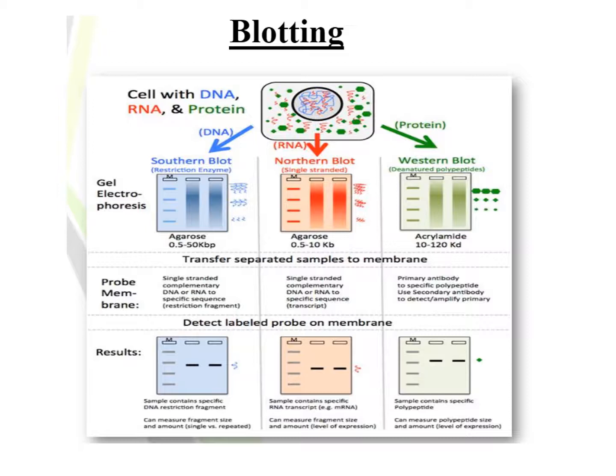So the large mass proteins will be at the top, the smaller proteins at the bottom, and so forth, right? And the spots as well in the 2D. So now we have a blot that we can then do the next part of the Western blotting. So we've already blotted it.